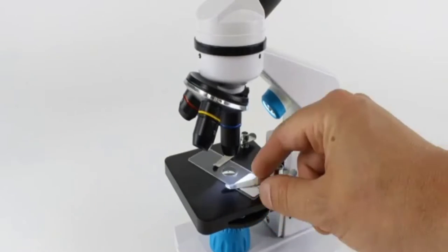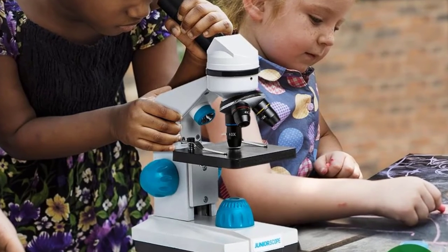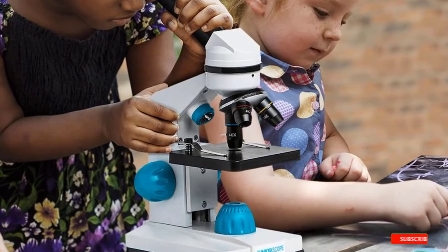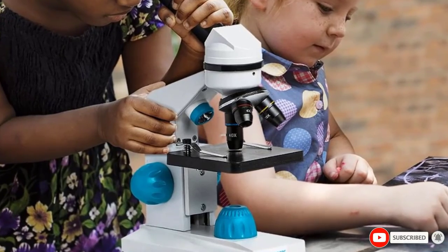What makes this a good contender for the best microscope for kids title are the accessories. From colorful investigation cards to peripherals like petri dishes, it has them covered.